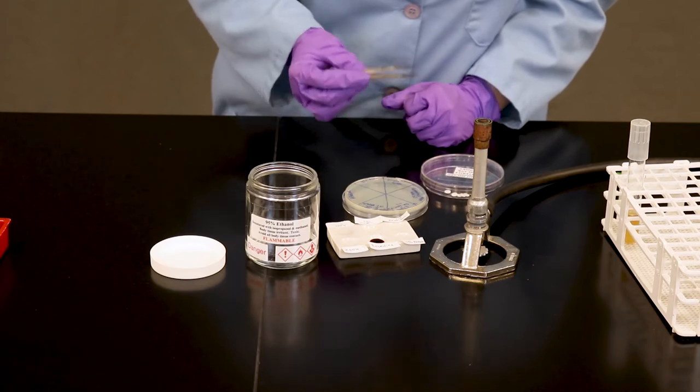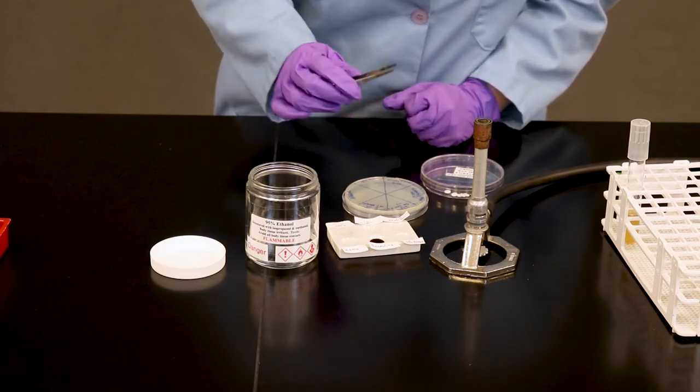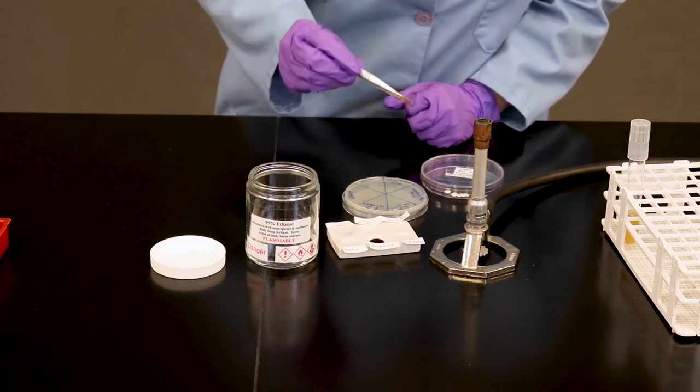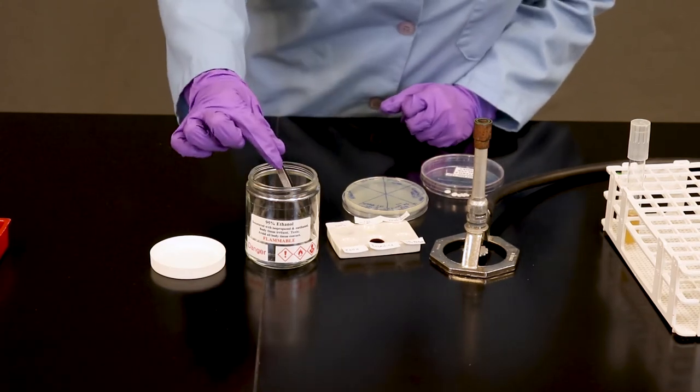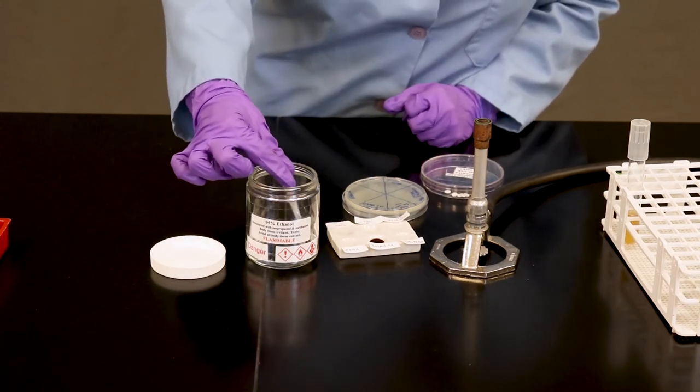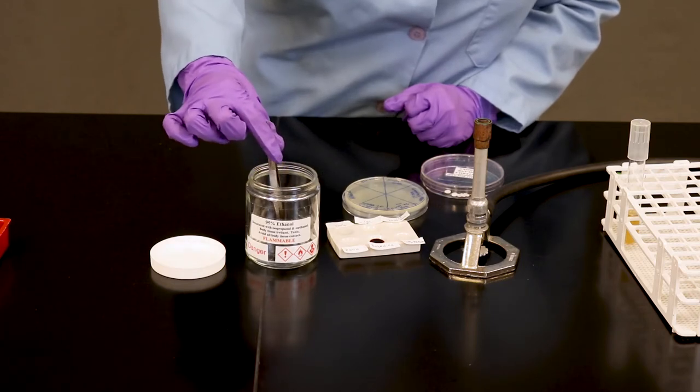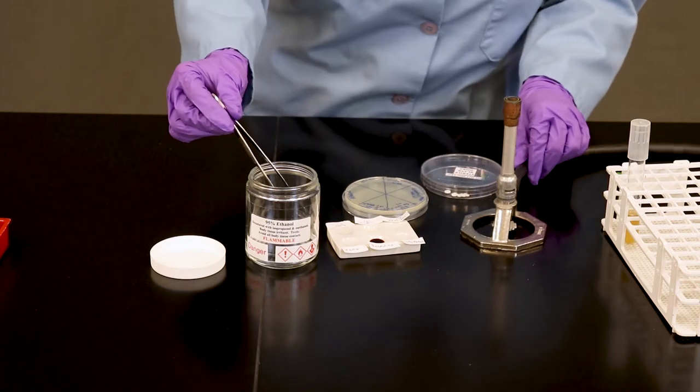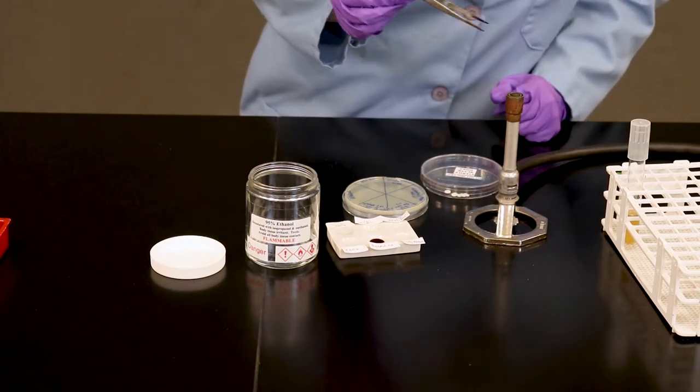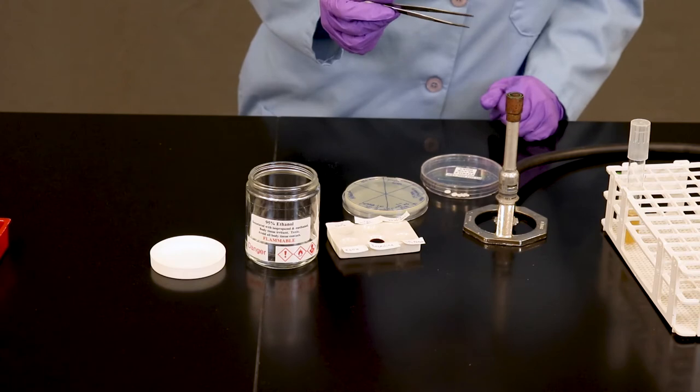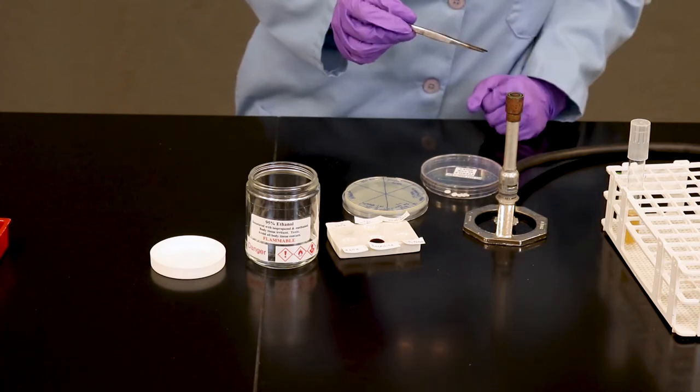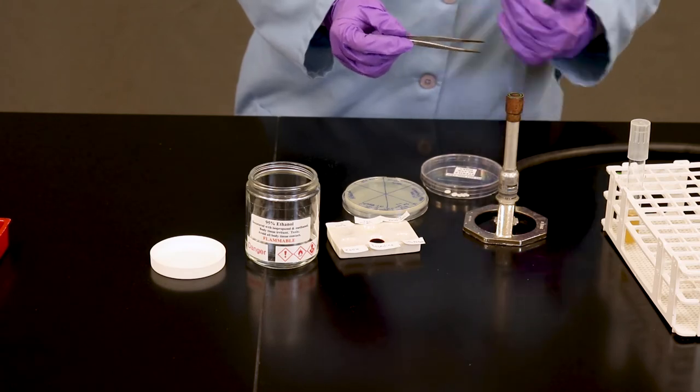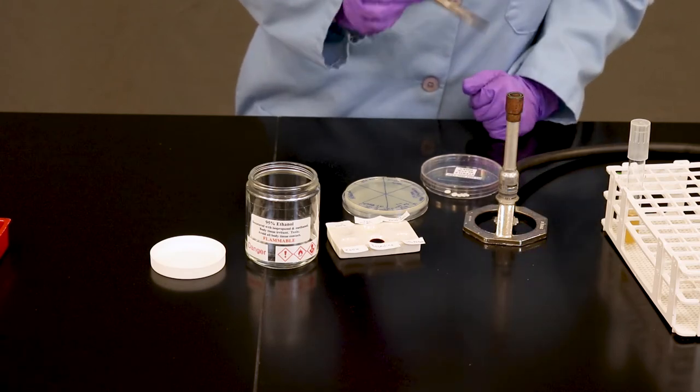In order to aseptically add my discs to my bacterial culture here, I'm going to flame sterilize my forceps. I do so by dipping the tip into the alcohol, shake off any excess, and I just want to very quickly pass it through my flame. You'll notice your forceps light on fire for a few seconds. You don't need to hold them here. Once the fire goes out, just let it cool for a few seconds, and that should be sufficient.